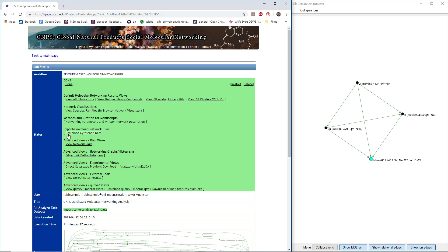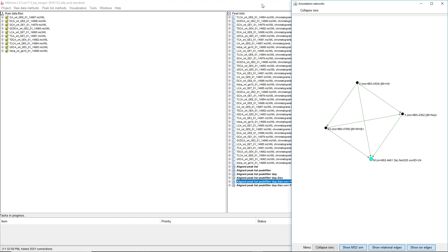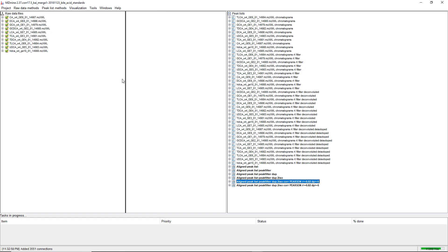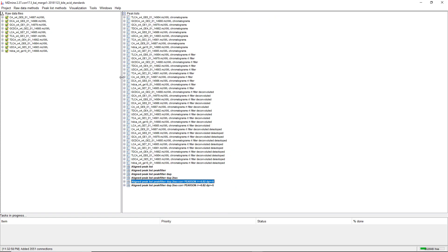We click on this link and then we get a zip file, and if we unzip it, in the first folder there's going to be a GraphML file. The GraphML file holds all the information of library entry hits, and also of the edges that were created with GNPS MS/MS similarity.